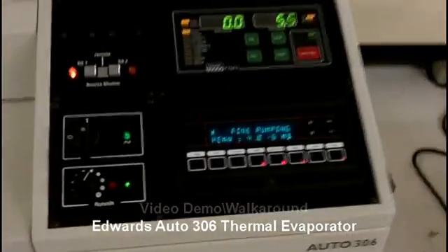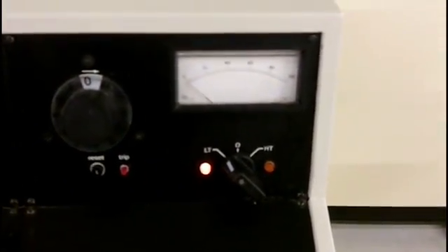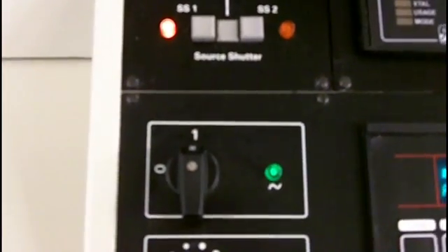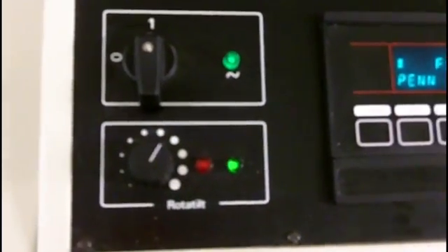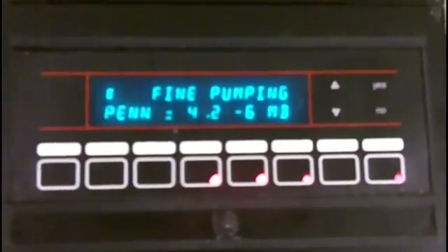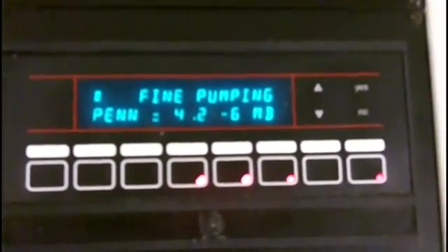To start off, I just want to show you the controllers. Starting up first is the thermal source amp gauge and controller. Next is the TC. Then comes the deposition monitor, followed by the shutter control. Then we have the main power, and then the rototilt controller, but there is no rototilt on this one. And finally is the automatic pump controller.